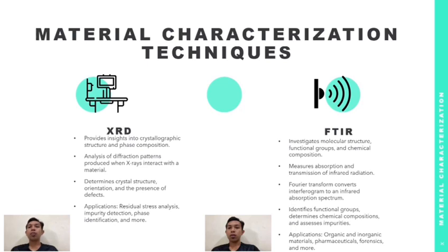XRD works on the principle of constructive interference of X-rays scattered by atoms in crystalline material. The resulting diffractogram shows peaks that correspond to the material's crystal planes, revealing important information about its crystal structure, lattice parameter, and phase composition. XRD finds application in investigating residual stress, detecting impurities, identifying unknown materials, and studying phase information.